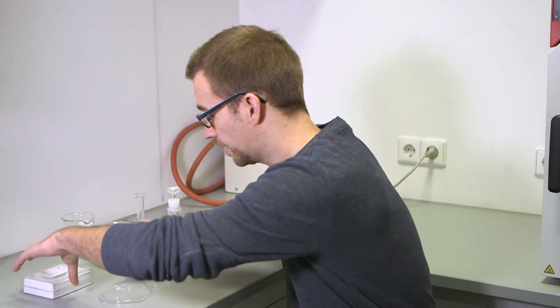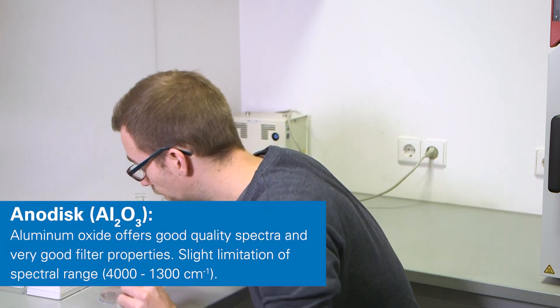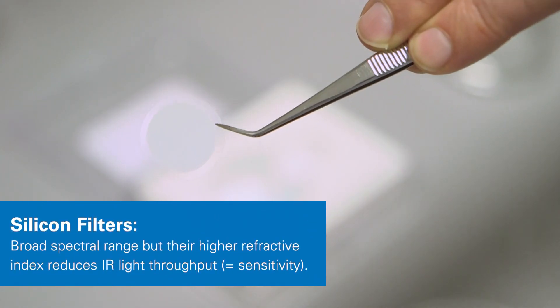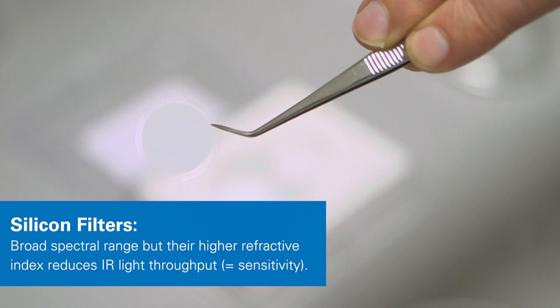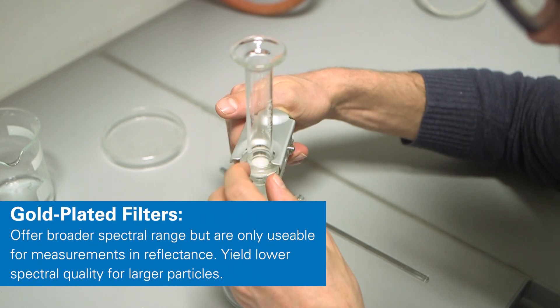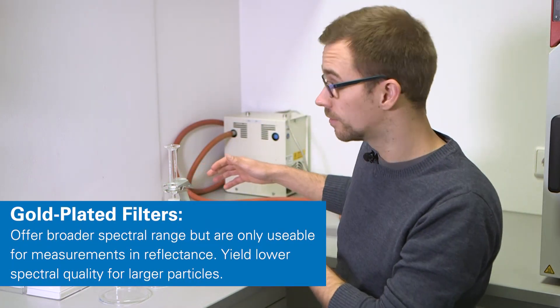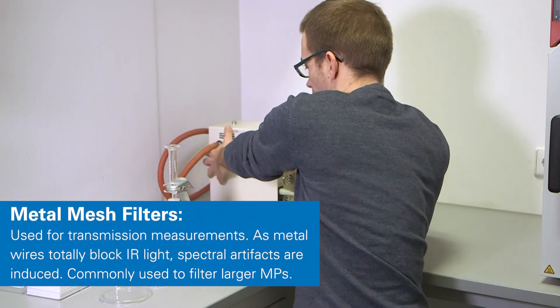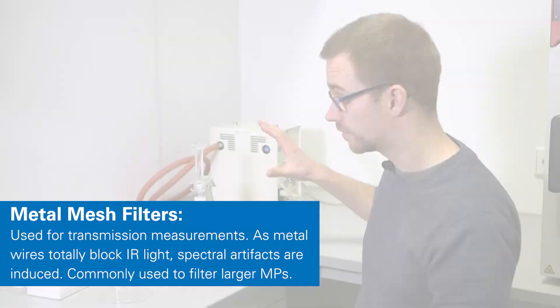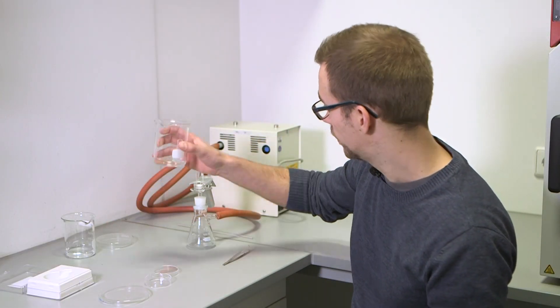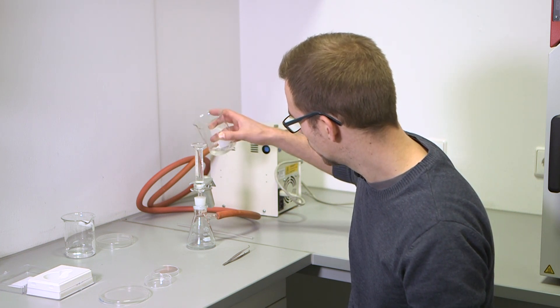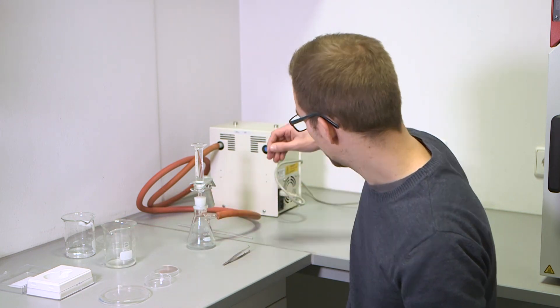So to prepare it, we're going to take an anodisc filter, place it on top of the glass membrane, put the cylinder on top, secure it with this clamp and for easier filtration we're going to use this vacuum pump. So now that everything is set up, we're going to fill in our sample and turn on the pump.